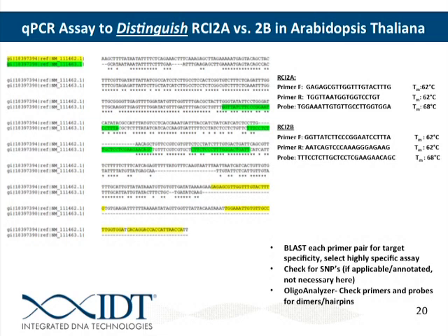So we've gotten our sequence of interest and put it into PrimerQuest. We got the assay from PrimerQuest and we've BLASTed for specificity, and that looked good. We've checked our first combination of primers in OligoAnalyzer to look for dimers and hairpins, and everything looks good. Now we'd also repeat that with the other primers as well.